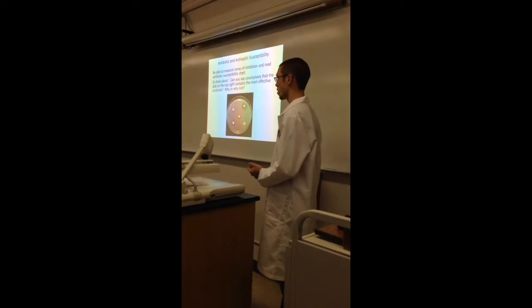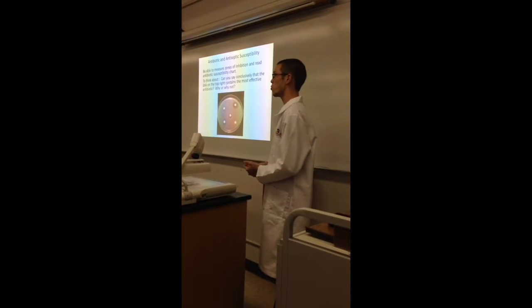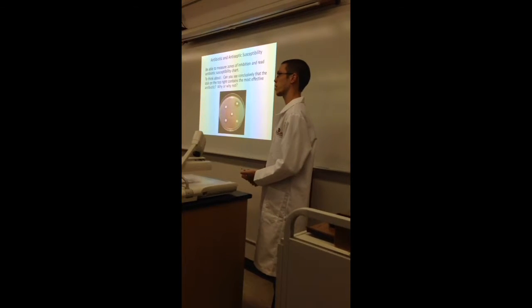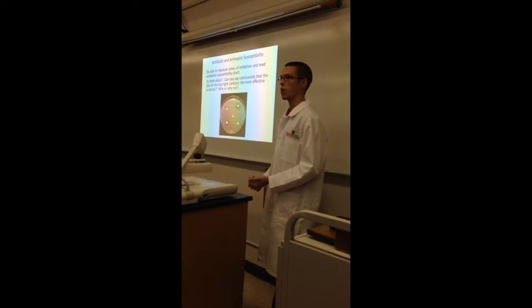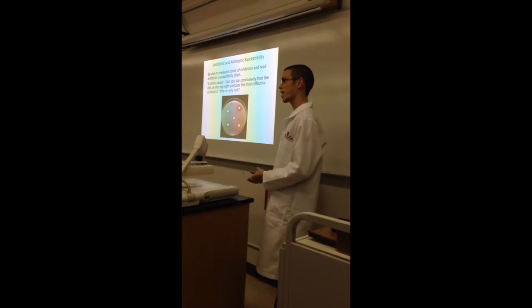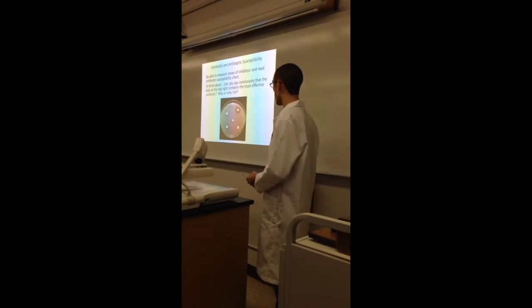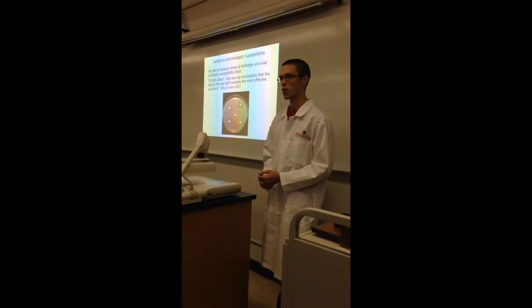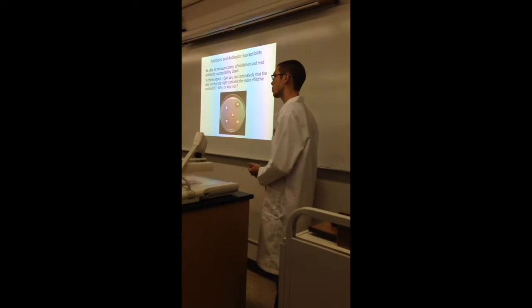What bacteria is on it? That's a good point. We don't know what bacteria. If you knew who you were looking at, say if it was gram-positive, then you would know something like penicillin that degrades the cell wall might be very effective, or if you know that it's completely lacking in the target of the antibiotic, that it wouldn't be effective at all. But what about the discs themselves? Do you need to know to determine whether the antibiotic is more or less effective than the others?